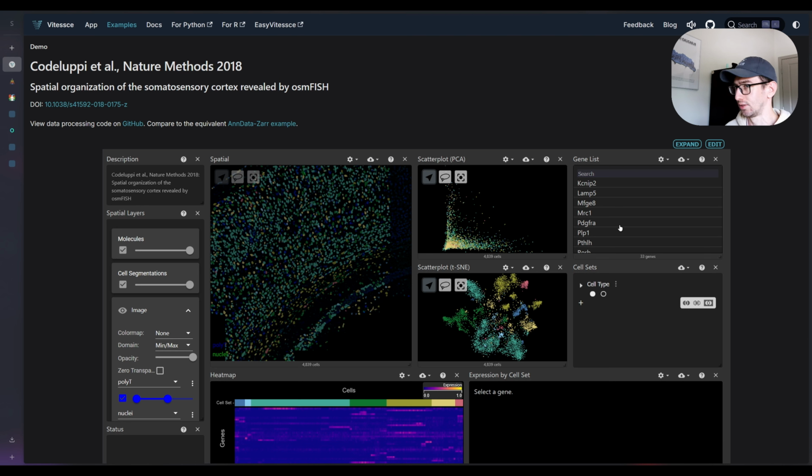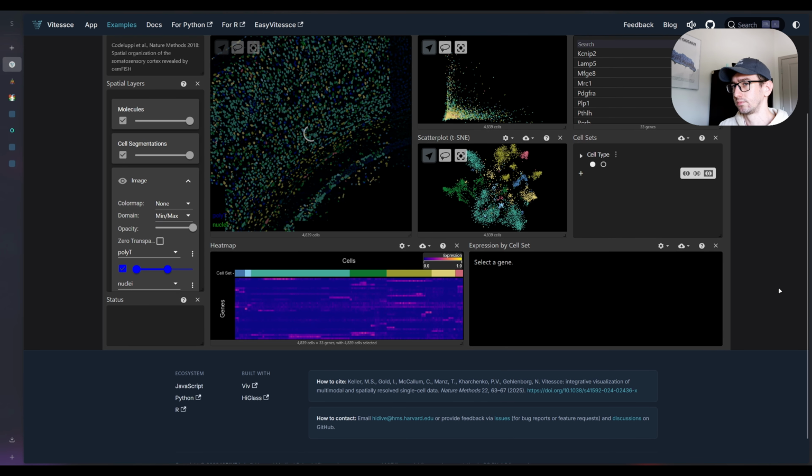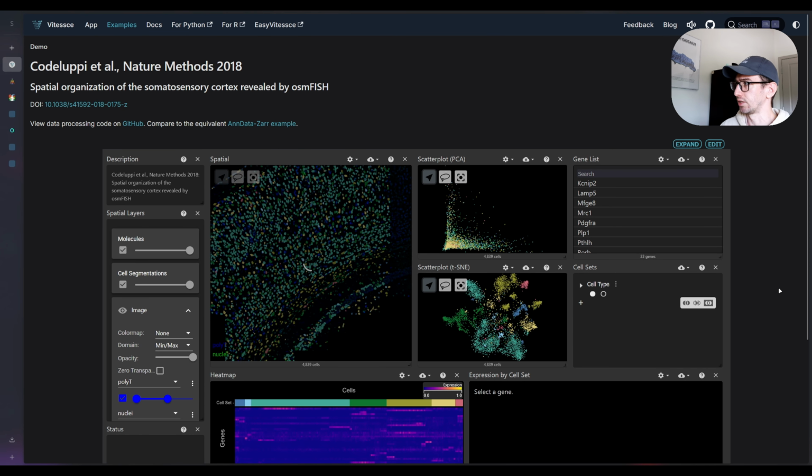It didn't work as I was expecting. But the idea is basically that we have the image. This is an input. The segmentation mask that you see on top of it is the result that we get after applying the methods. Okay, this is the idea: we want to be able to do something similar.